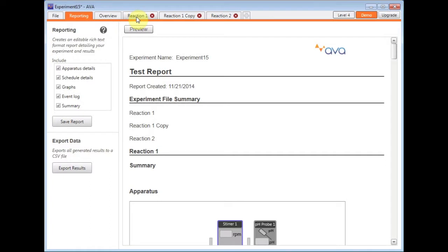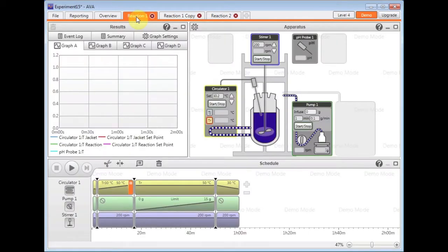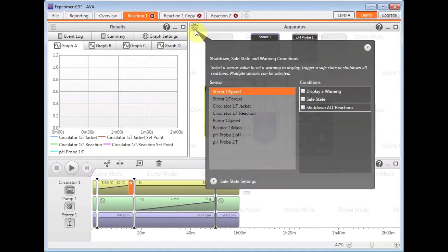I'm just going to go back to my reaction tab. You also have some advanced safety features for your system that you can put in place by clicking on the settings wheel in the apparatus window.